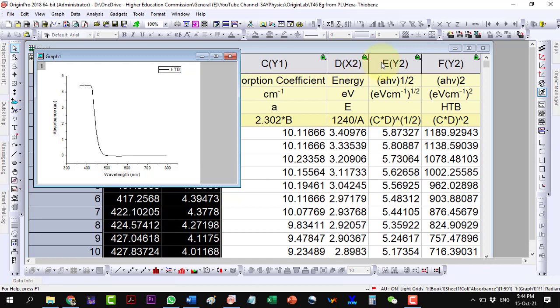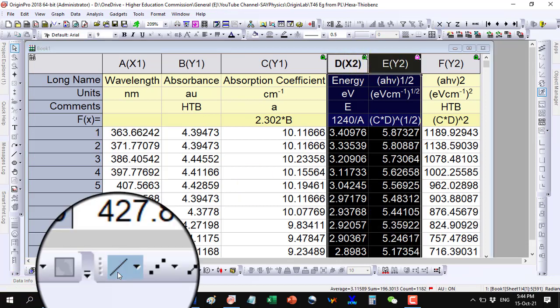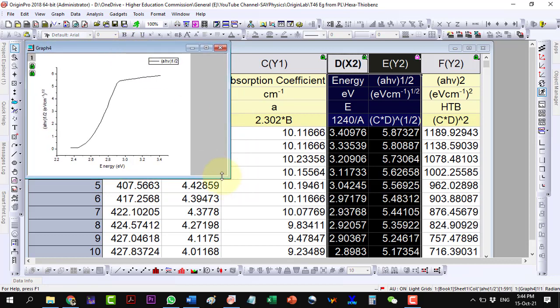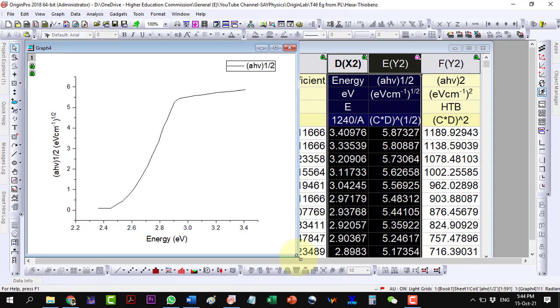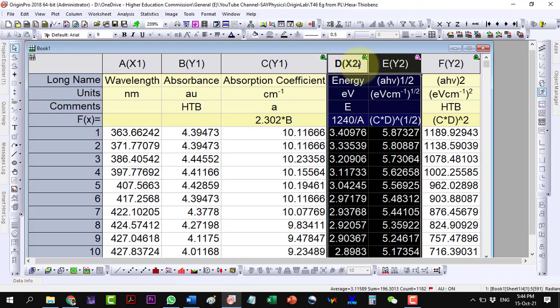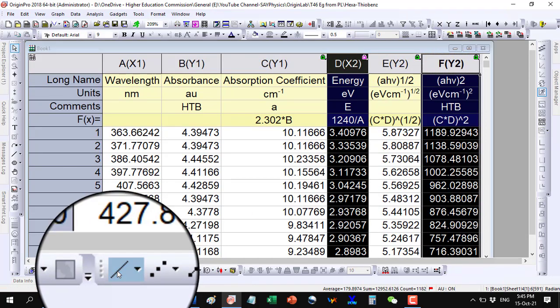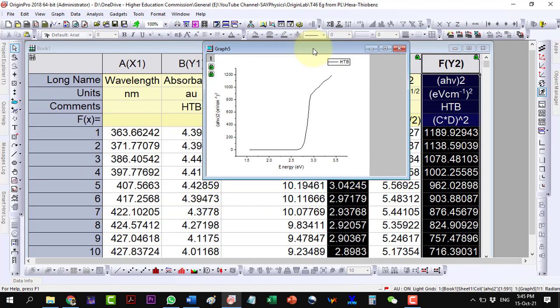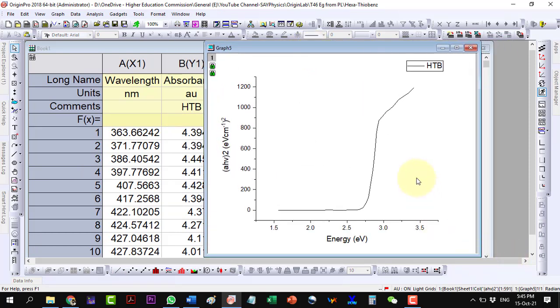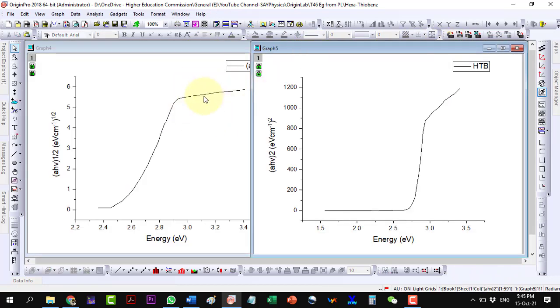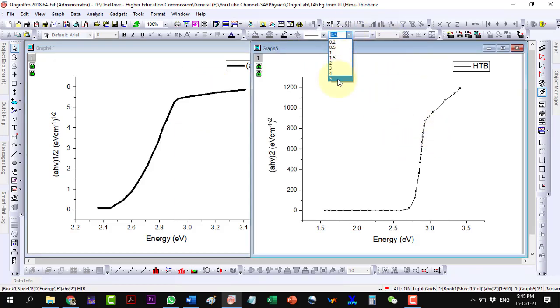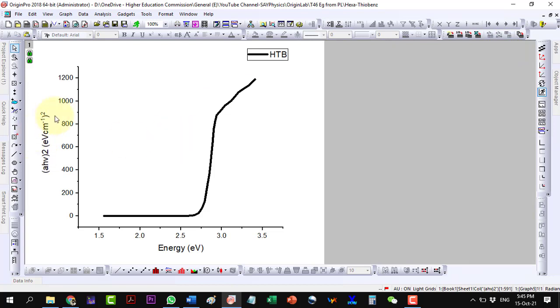Now, plot the indirect bandgap first and then the direct bandgap. We can see that the linearity of the direct bandgap is more, so we will consider it. Let us extend the linear region onto the x-axis to get the value of the bandgap.